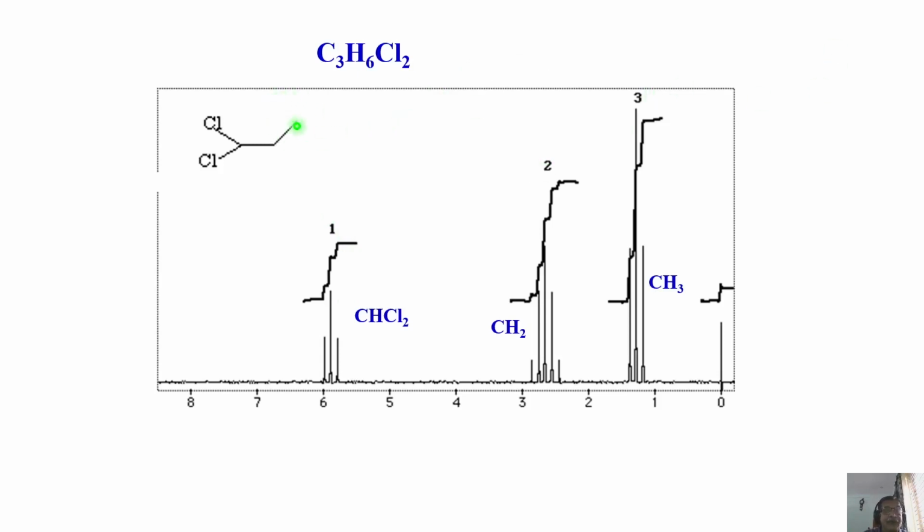If you write, see what is happening here. This is the CH3 group. This CH3 is split into a triplet because of the CH2 here. Two equivalent protons are present here, the CH2 group. This will split the CH3 into a triplet, correct? And there are 3 protons, terminal CH3, intensity is 3. What about this one? This is the CH2 group. It is coupled to CH3. As a consequence, it will split this CH2 into a quartet. Use the 2nI plus 1 rule. It is a quartet, 1331 quartet.